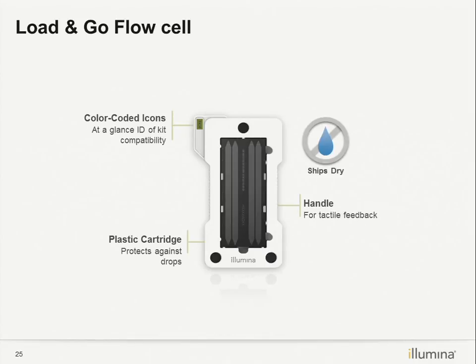Okay, so this is the flow cell. The area that we are going to cluster and image is these four lanes, the gray area. But never touch this area with your bare hand, or even when you wear gloves. So we have a handle, the right side of the handles, where you can handle the flow cell. So what we suggest is to wipe this way, along the flow cell like this, instead of this.